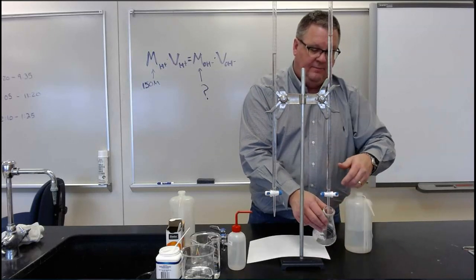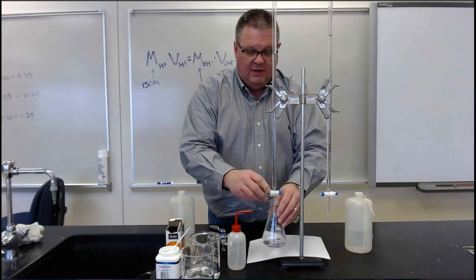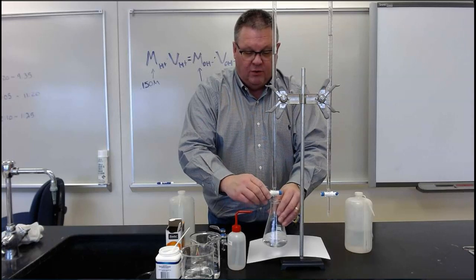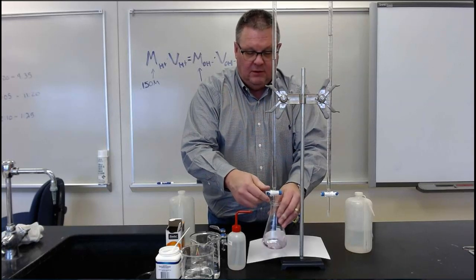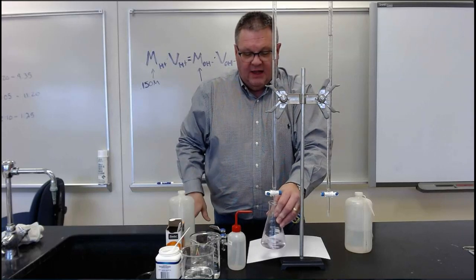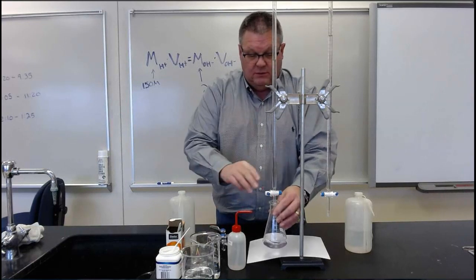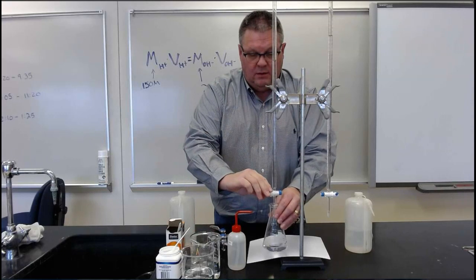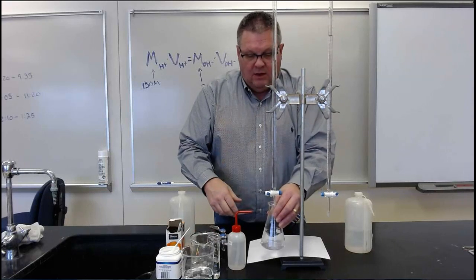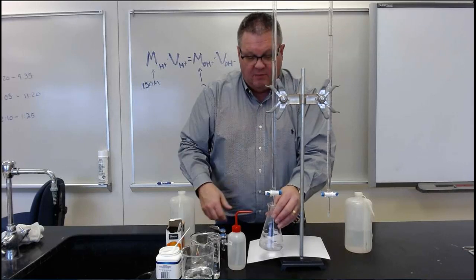Okay, it did. And now we can add base at a slower rate, a much more controlled approach to the endpoint until you get a lightest perceivable pink to stay for a minute. That went away. And when you get good at this, you can kind of spin this so quickly that you can clip off about a third of a drop.